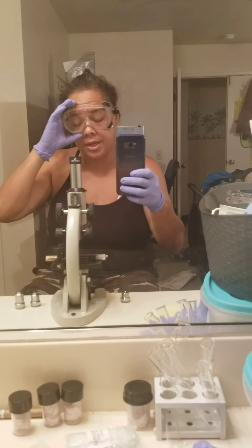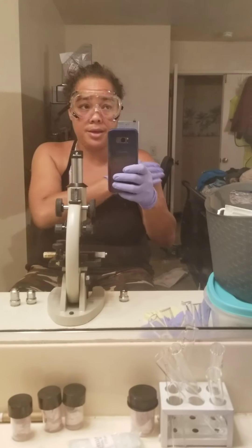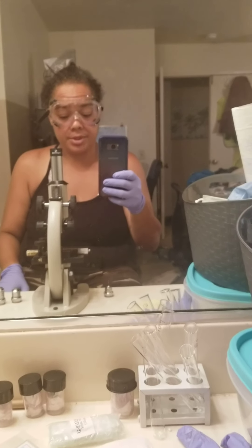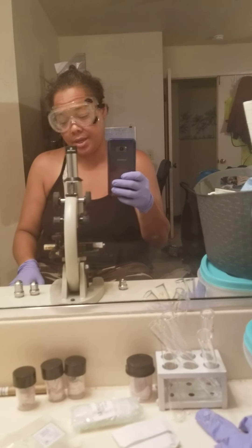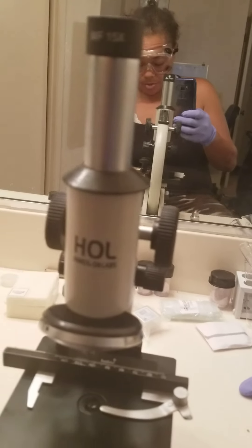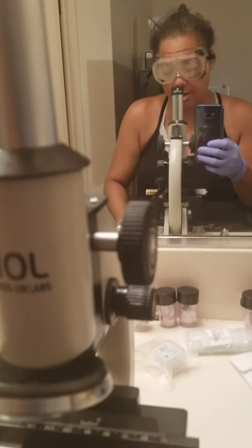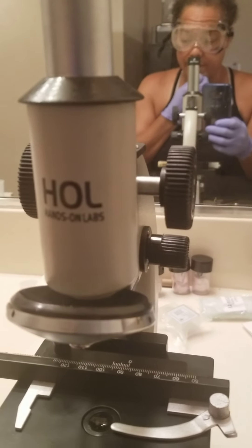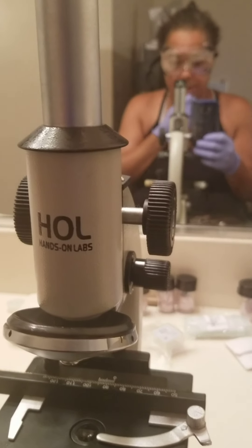Hello, this is Desiree Craig. It is July the 21st and I'm sitting here with my microscope. I've gone through the process of taking all of my parts and putting them on, so I'm going to try and redo the yeast.